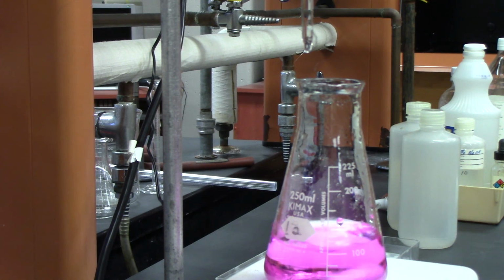For part B, finding out the concentration of the acid, you will have the mass of your vinegar. So there's two experiments. Actually, the first experiment, you had three: one, two, and three. The second one, you had two. Again, you had the mass of your acid, and then you had the initial NaOH, and then 50, and then initial, and then endpoint. You have to add up those total amounts of volumes to figure it out. And you have two of them, and we'll show you how it works.